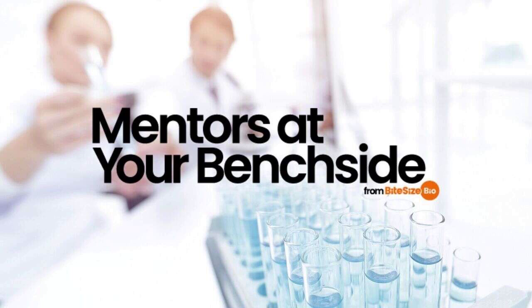To overcome the problem, try using a specialized competent cell line. For unstable inserts, try the STBL2 cell line from Life Technologies, and for growing clones with toxic proteins, try the T7 Express lysY/Iq competent cells from NEB. Another important point is how the insert size changes the copy number of the plasmid. Large inserts will reduce the number of copies of the plasmid, meaning you may need to grow more cells to get a decent yield.